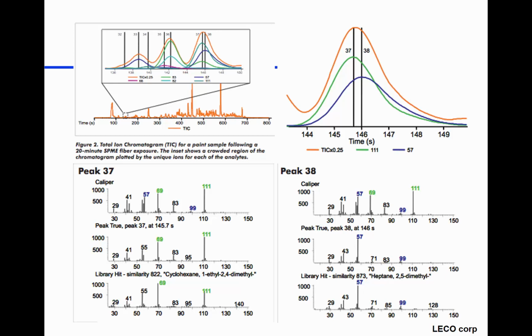This is taking this other part into pieces, and maybe we won't spend so much time with it. But what you would find is that when you blow peak number 37 into bits, these are the pieces that molecule gives up. Peak 38, which isn't separated, blows into these kinds of pieces. So the instrument really takes that set, follows them together and draws a peak. Then you can measure and you can quantify. So it's really, really a powerful tool. It's a tremendous addition to any kind of analytical chemistry.